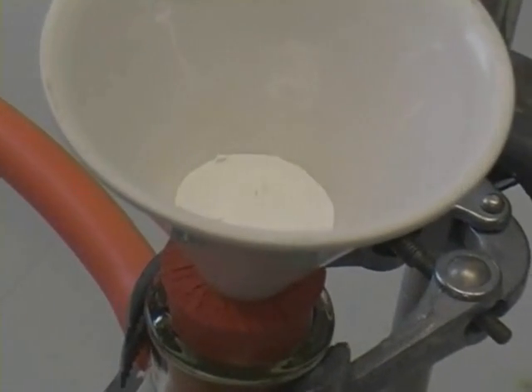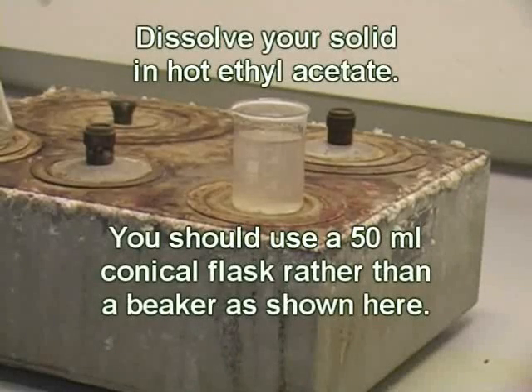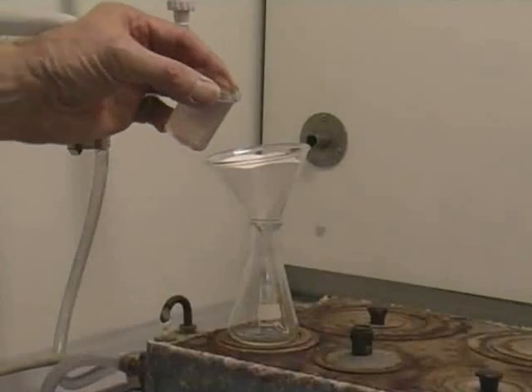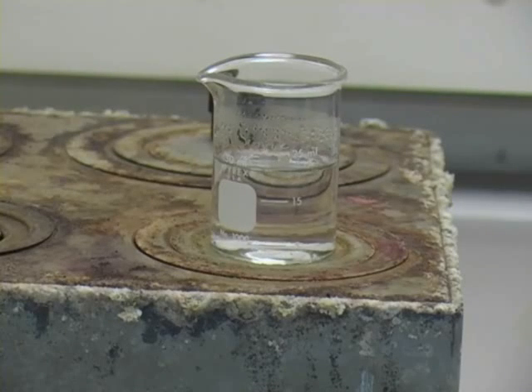Transfer the solid to a 50ml conical flask and add enough hot ethyl acetate until it dissolves. Put the flask on a steam bath. Filter through a hot glass funnel into a hot conical flask, then transfer the liquid to a 25ml beaker and evaporate to about 7ml.